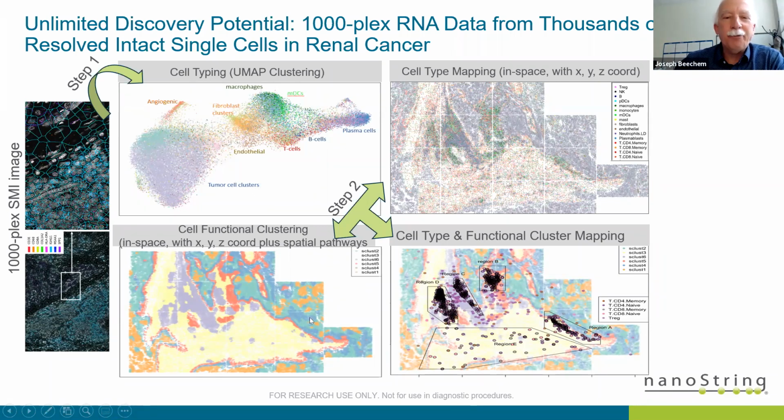So we combine these functional neighborhoods with the cell identification and make overlay graphs. Here I'm plotting specific types of T cells in the right lower quadrant, superposing that on these functional domains where weird things happen in tissues. And yes, you can explore these data sets. They're so information rich on so many aspects of biology, but this gives you a feeling for the first-pass kind of things you can do. And this is the reason why all of us do spatial biology, because the information content is so dense and so rich.